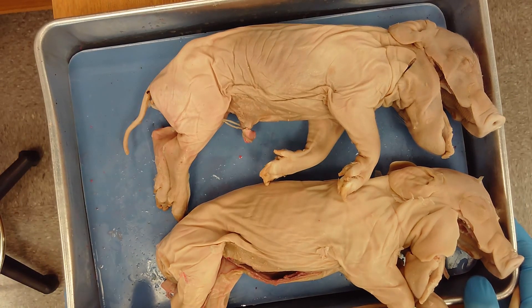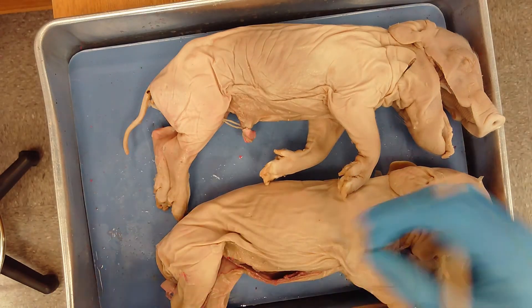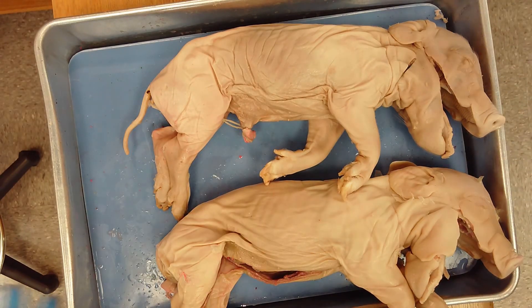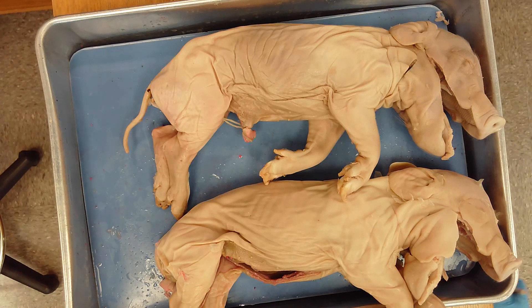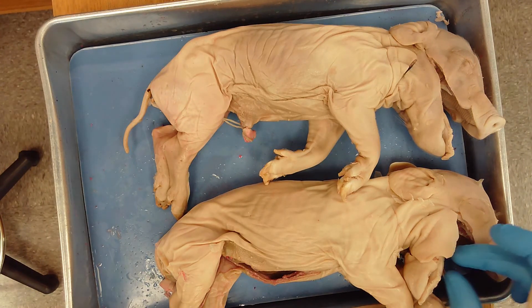Here we have our pig dissection. I'm going to go through what we did in lab during our first week, which includes external anatomy, digestive system, and respiratory system, as well as some structures within the mouth.